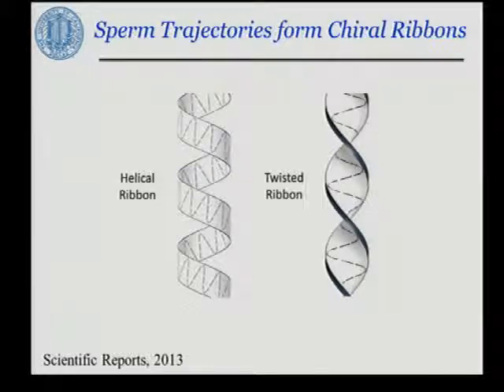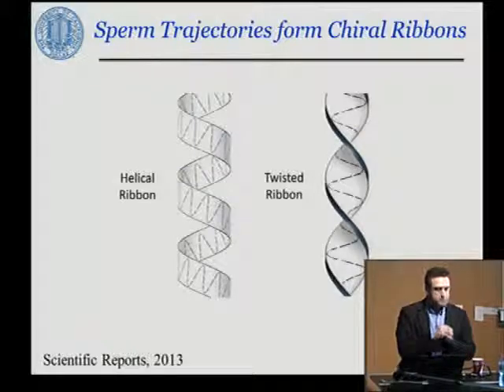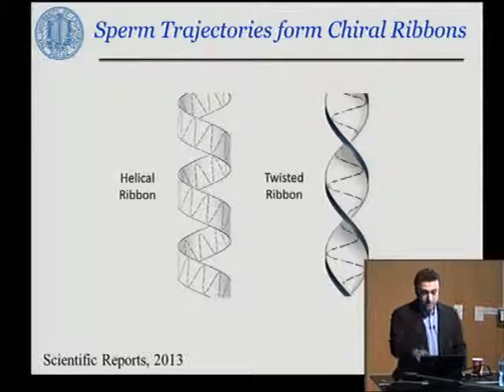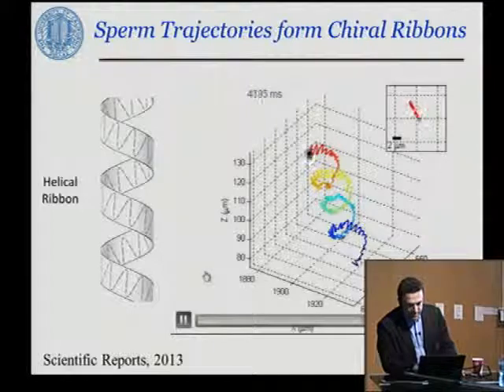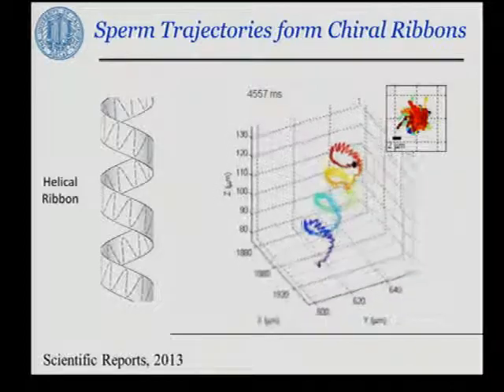But over the last year or two, we've looked into other species beyond human sperm. In this case, looking at horse sperm, we were able to discover some new patterns. These are ribbons, chiral ribbons, we call them. So you have a sinusoidal, zigzag pattern on a plane. Very simple modulation. But that plane itself is twisting in the form of a twisted ribbon or a helical ribbon. This is actually a horse sperm that we're recording over 4 seconds. And it's connected to this beautiful helix, as you can see here. It's soon going to rotate and give you the perspective of the sheet and how it's conducting this sinusoidal pattern.